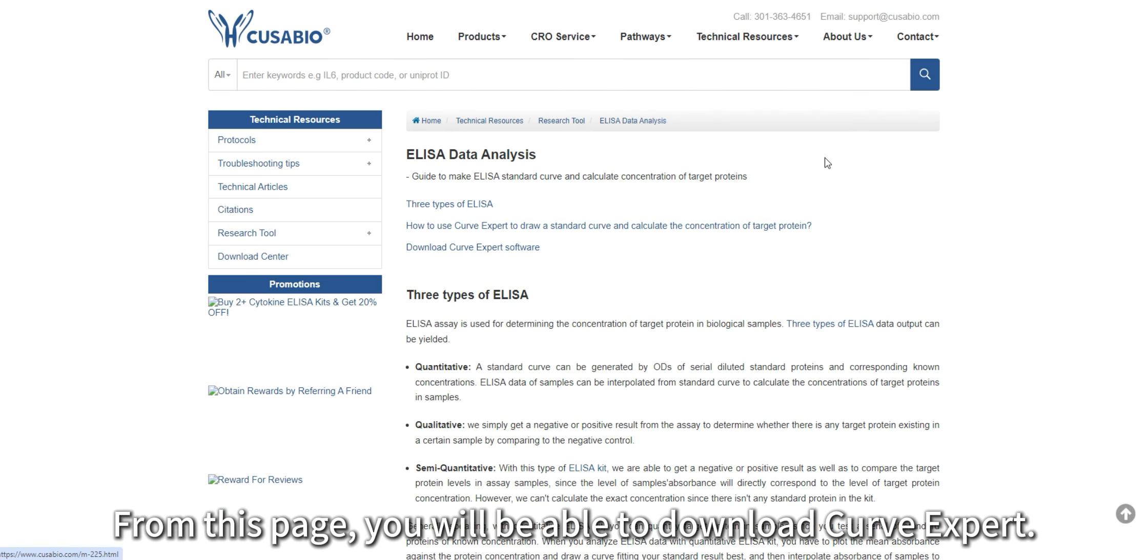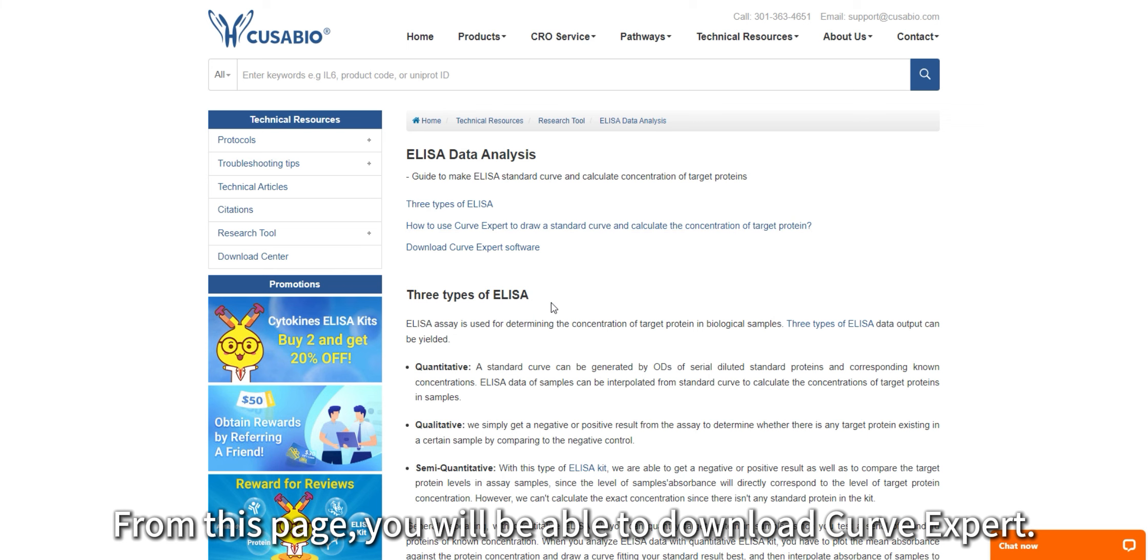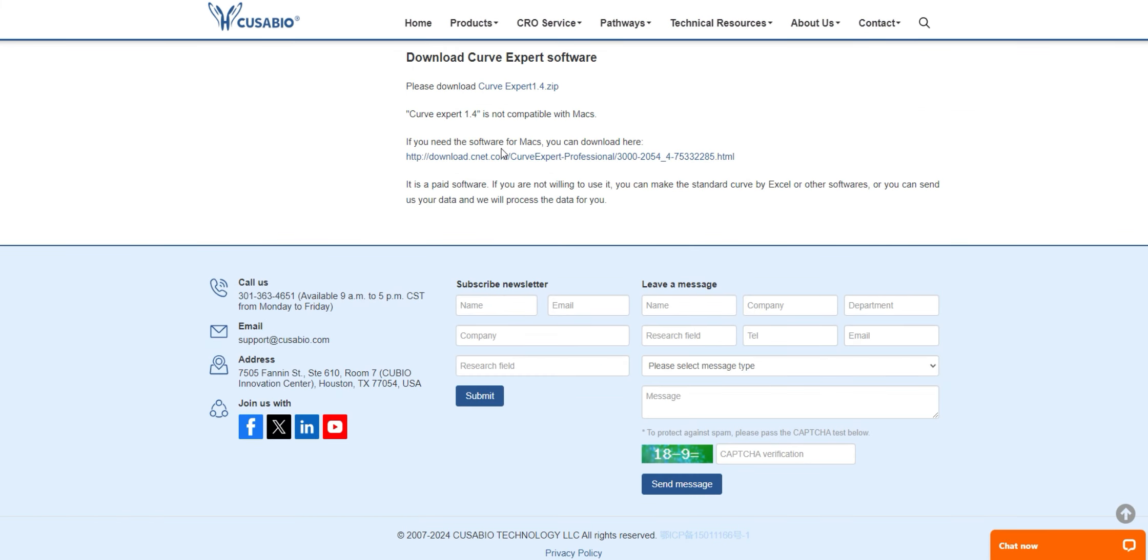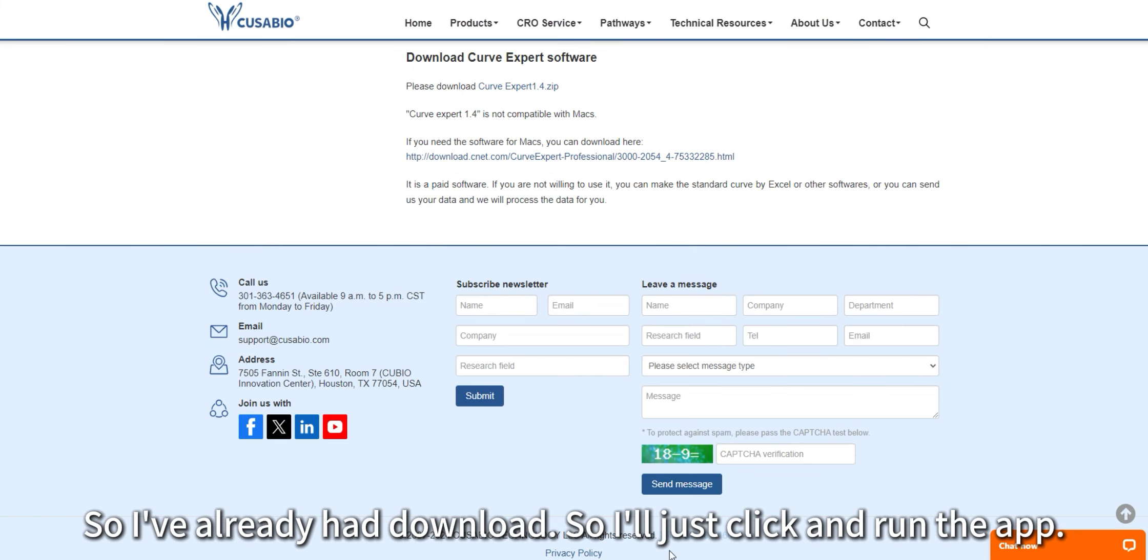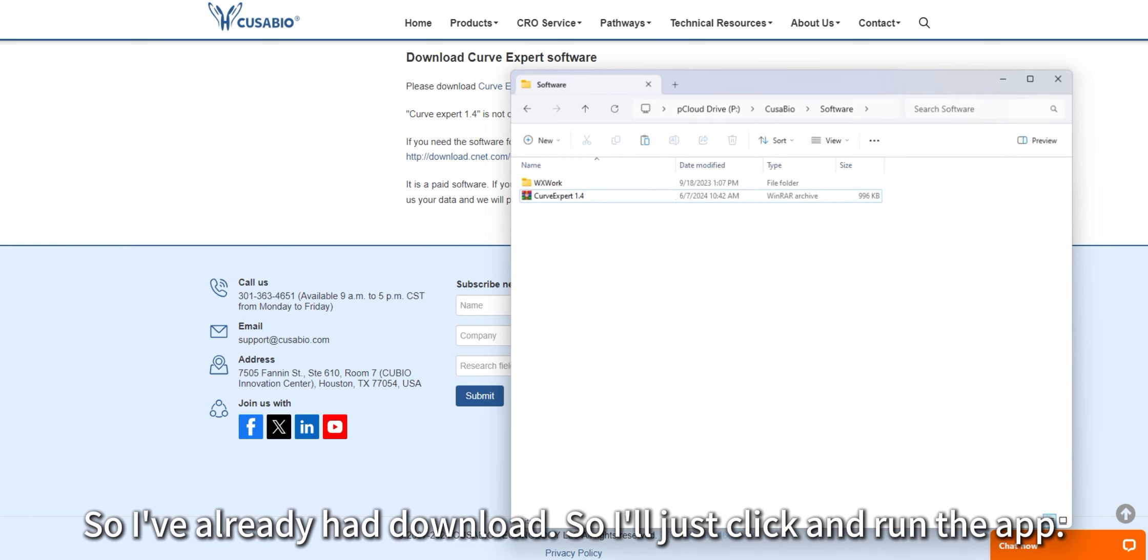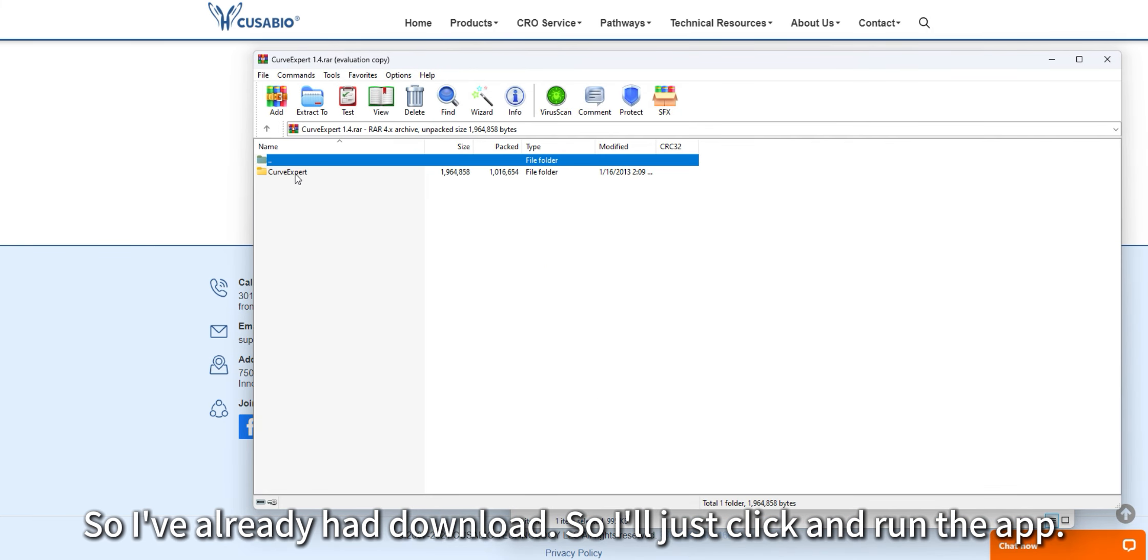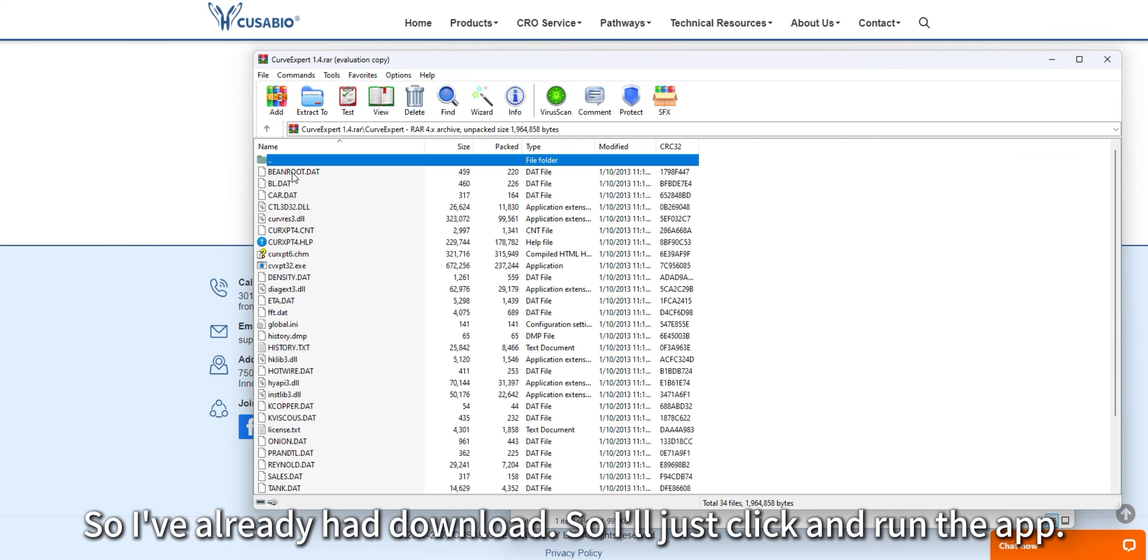From this page, you will be able to download Curve Expert. I already have it downloaded, so I'll just click and run the app.